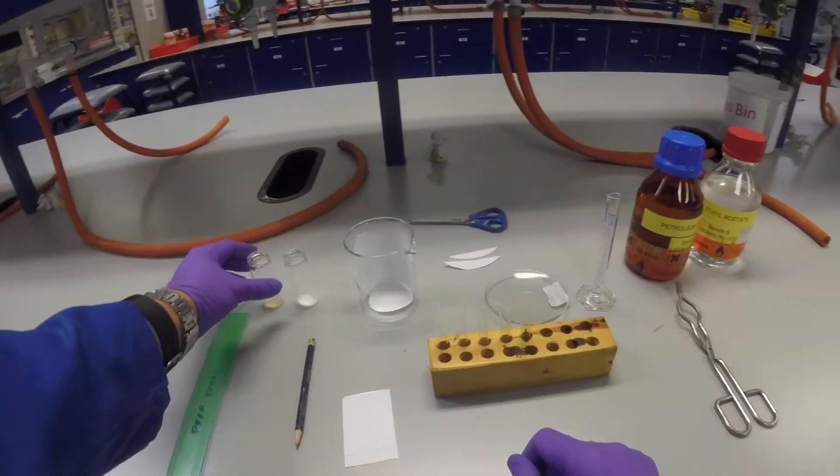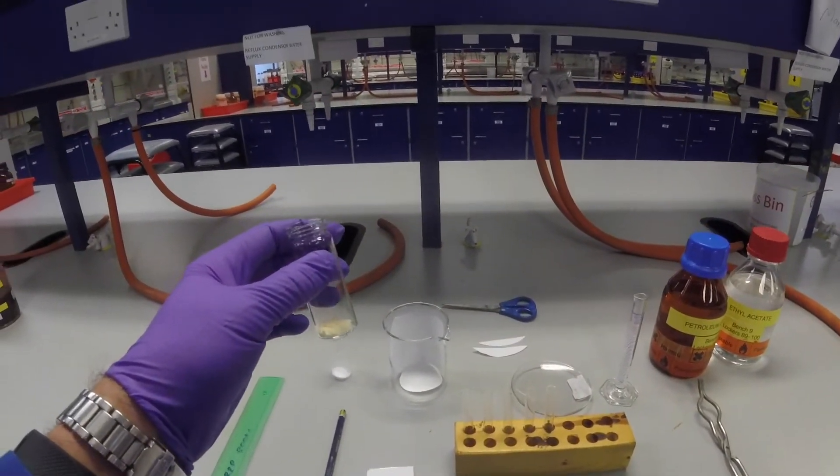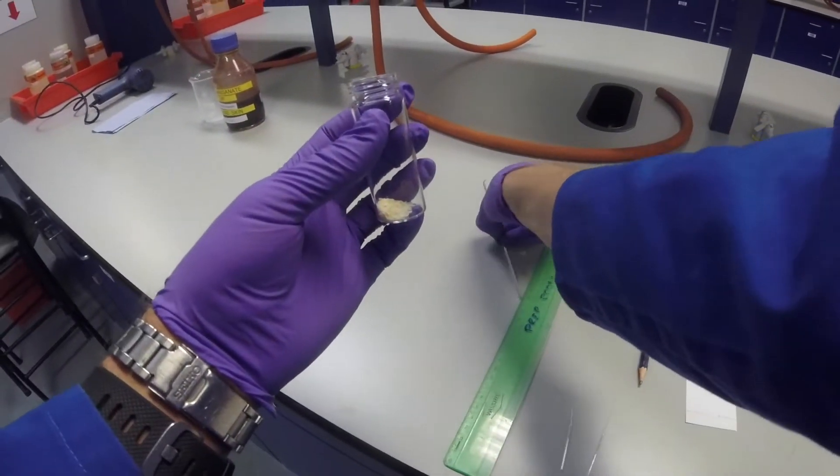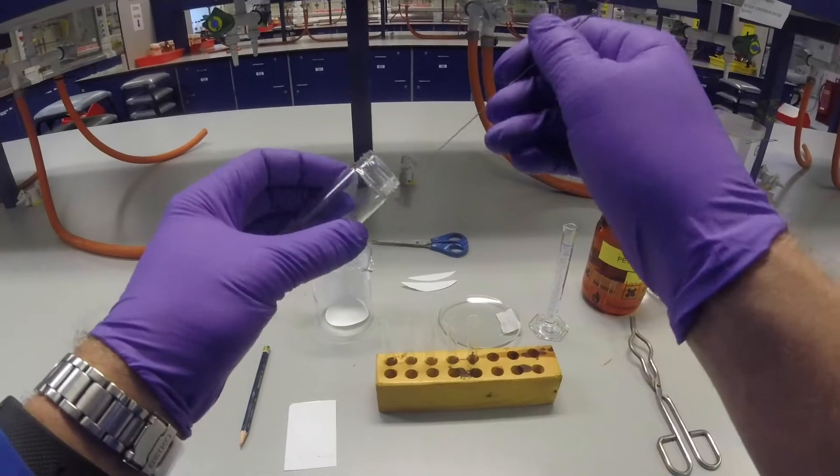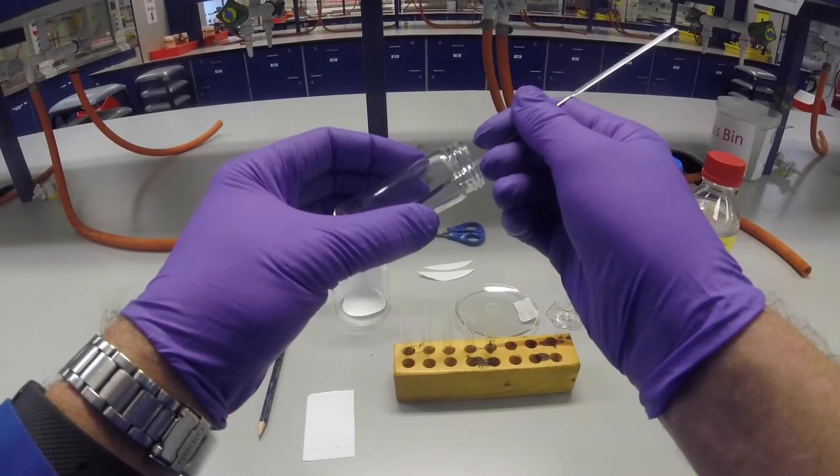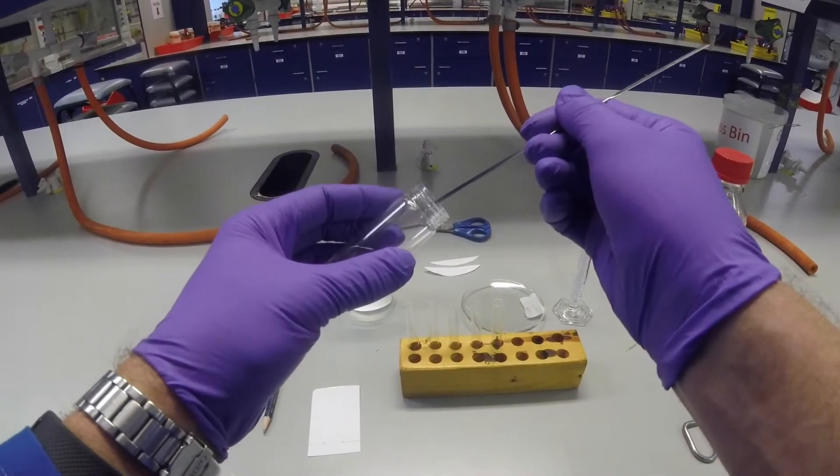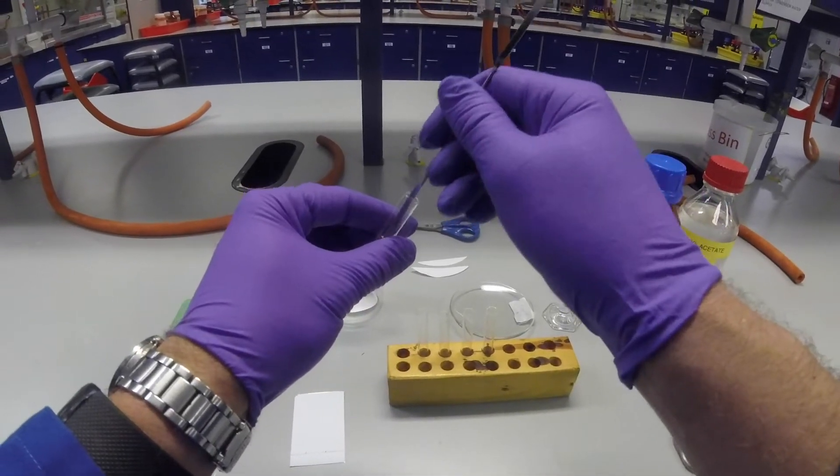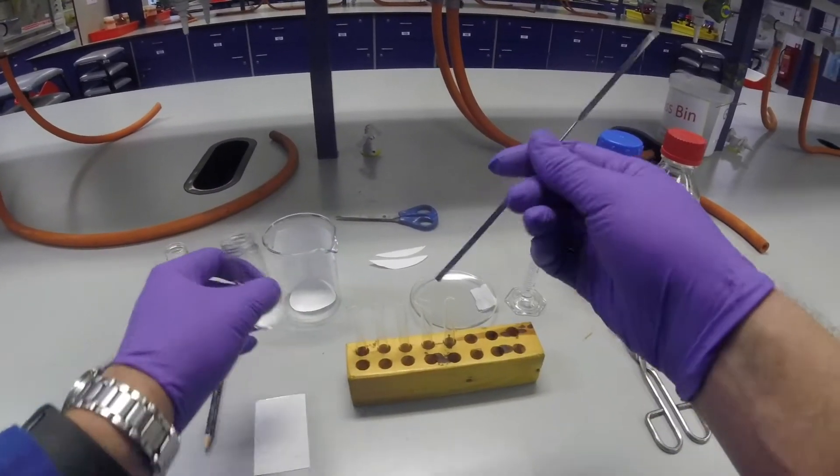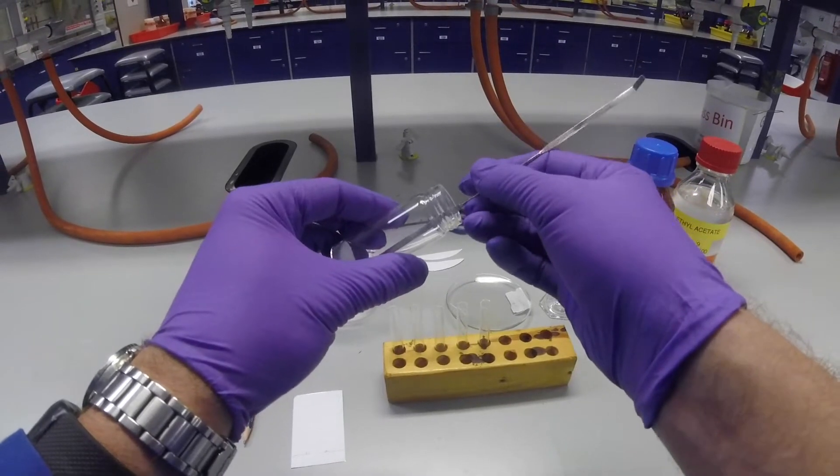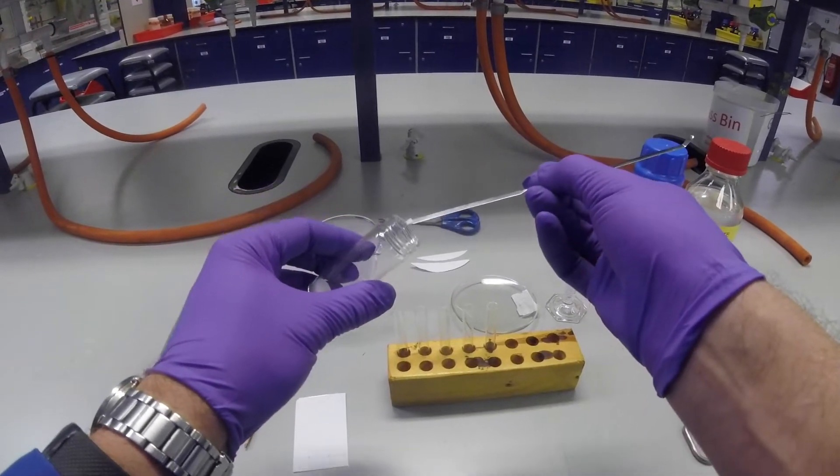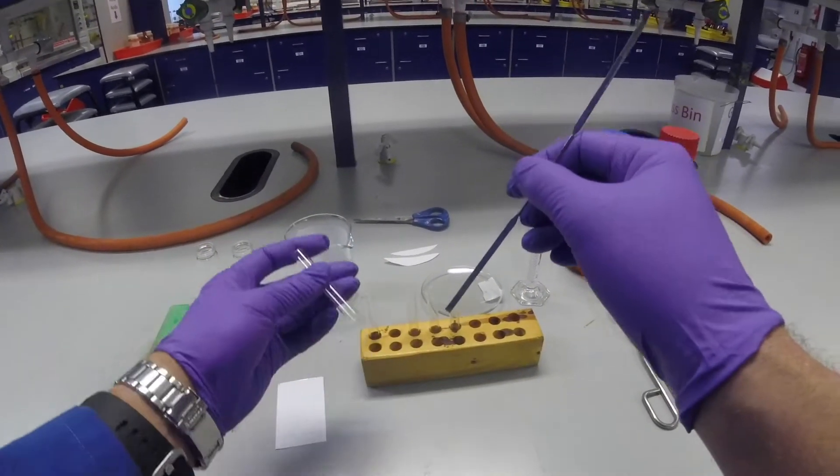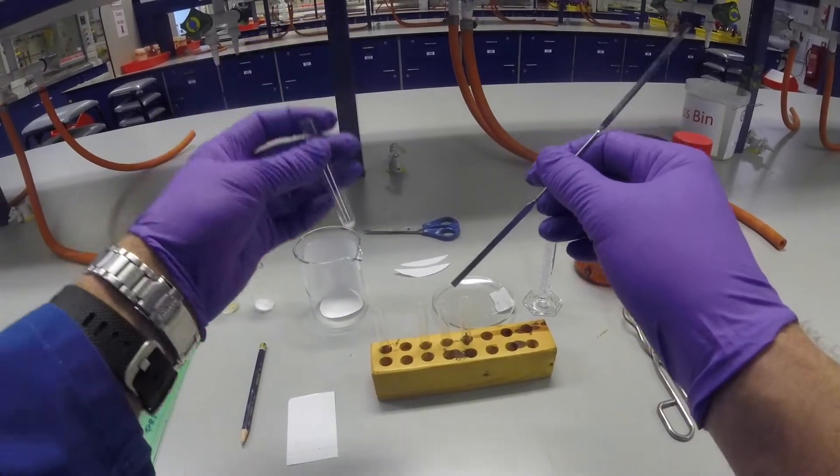We're going to take our compounds. TLC is a very sensitive technique, so you don't need very much of your compound. We're going to take a small amount of each compound, a few milligrams with a micro spatula, and pop them in small test tubes. This is the other compound we're going to look at, unknowns, and pop that into another vial there.